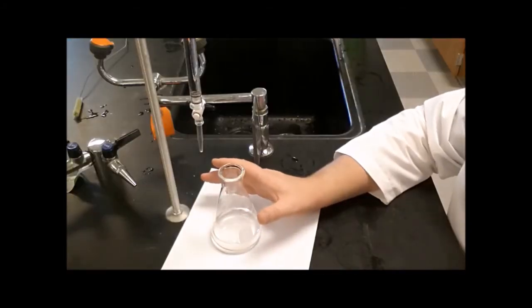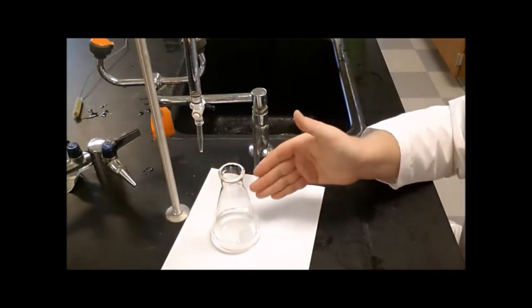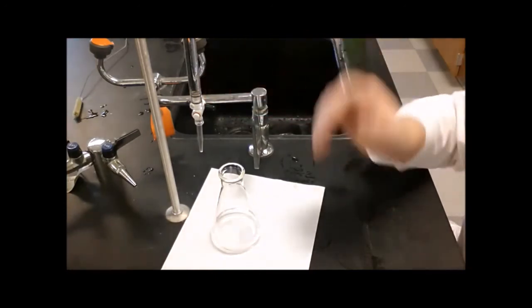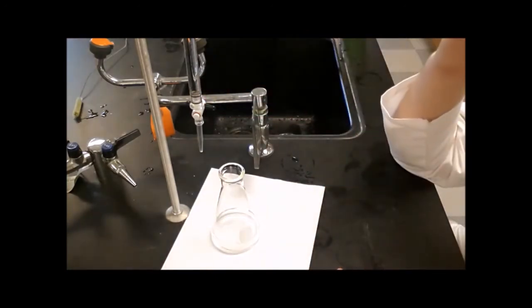The stage is set and everybody's ready. It is now time to actually do the titration. The acid's in the flask, the base is in the burette. I have a little piece of white paper underneath the flask so I can see the color change more obviously.